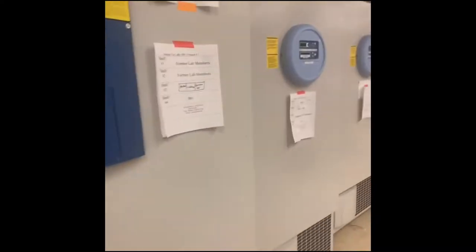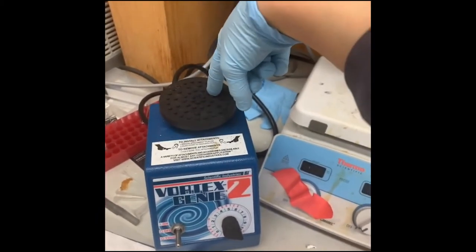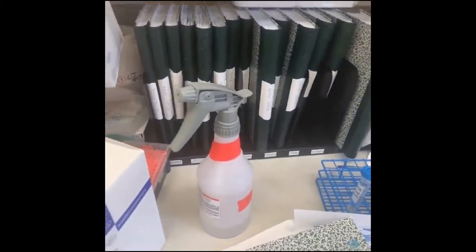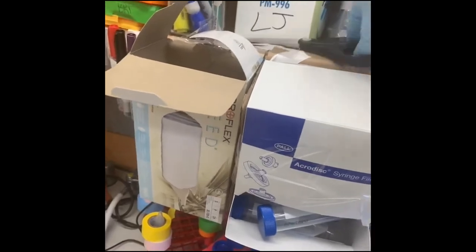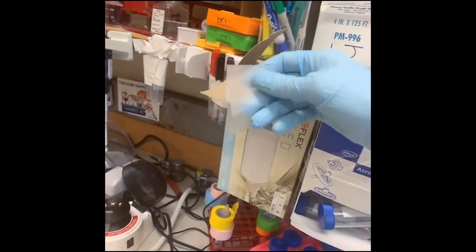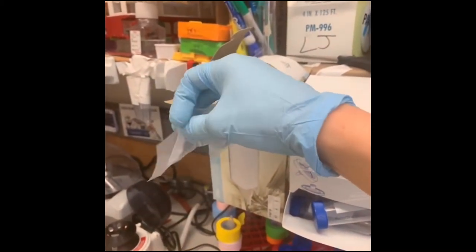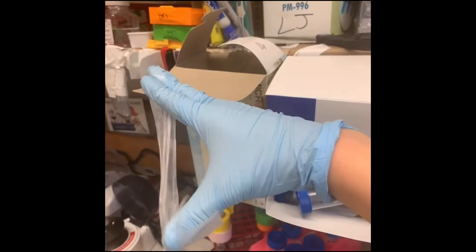We also have a lot of other stuff like freezers — this is a minus 20 freezer and these are our minus 80s, which we use for long-term storage of sensitive things like proteins. A couple last things: this is a vortex — you stick something on here and it vortexes, mixing it up really well. And I can't forget to show you parafilm, which is like the world's greatest thing. Parafilm is kind of like a waxy, thick cellophane-type stuff — you can stretch it out a lot and use it to wrap around the edges of tubes or petri dishes to prevent leaking. It's really fun to play with and lasts forever.